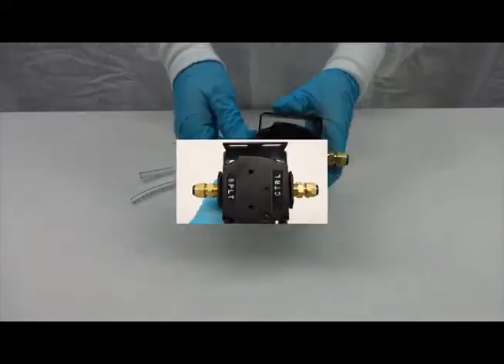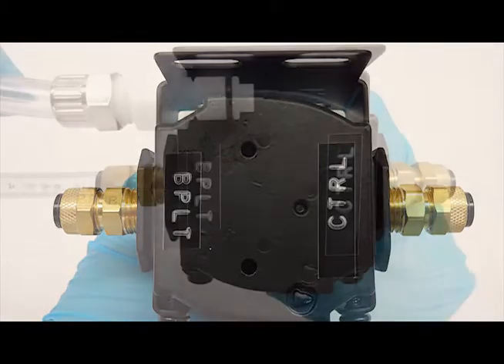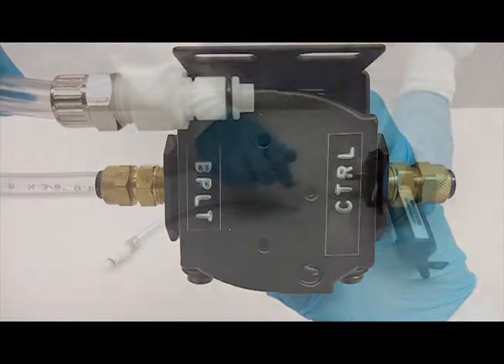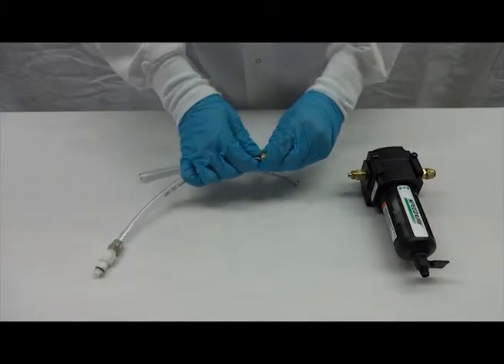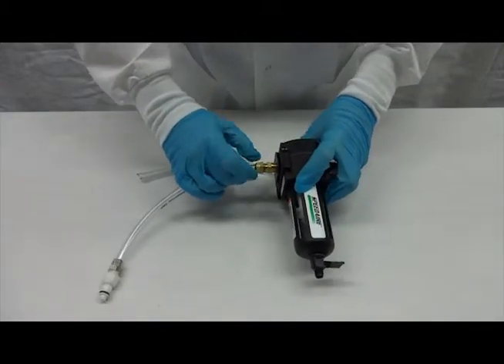Remove the brass nut with the acetyl sleeve from the BPLT or base plate port, insert the tubing with the quick disconnect attached, the side that goes to the base plate, into the acetyl sleeve, push the tubing onto the fitting, and thread the nut onto the fitting by hand.